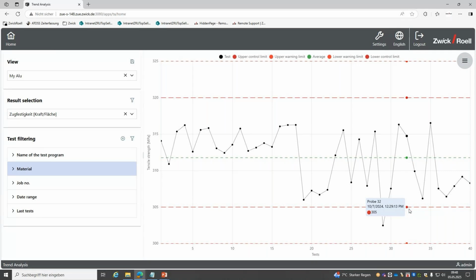And this also gives you the possibility, in one example, to make a supplier evaluation. For example, I do incoming goods control from a supplier, and then I can see supplier A has a very straight line. Maybe supplier B has a bigger scattering. So then I have a very fast indication to go back to my supplier and ask what's wrong with, for example, your product line.